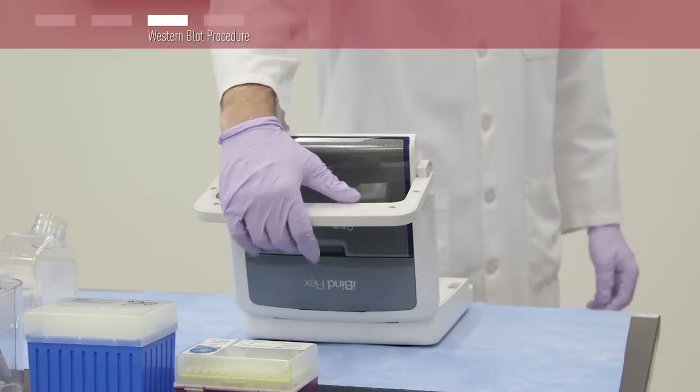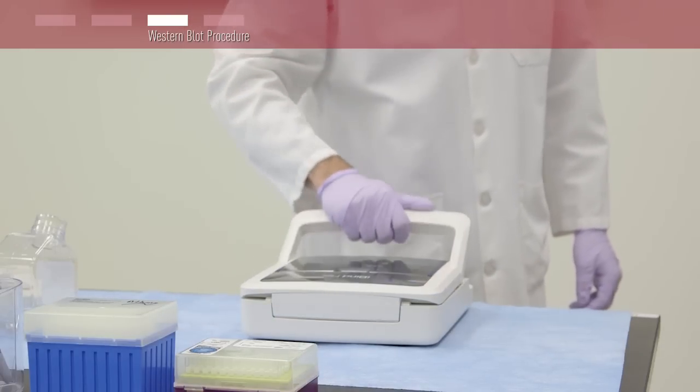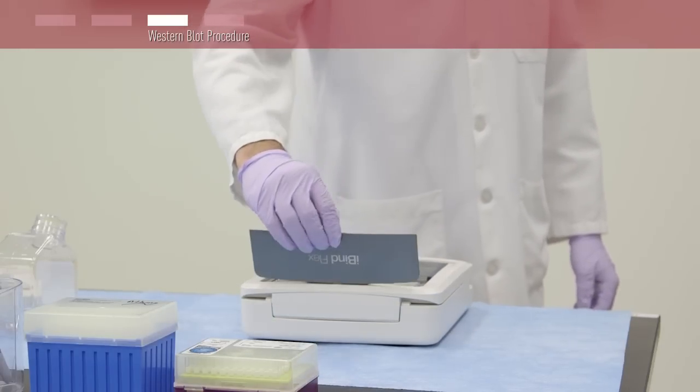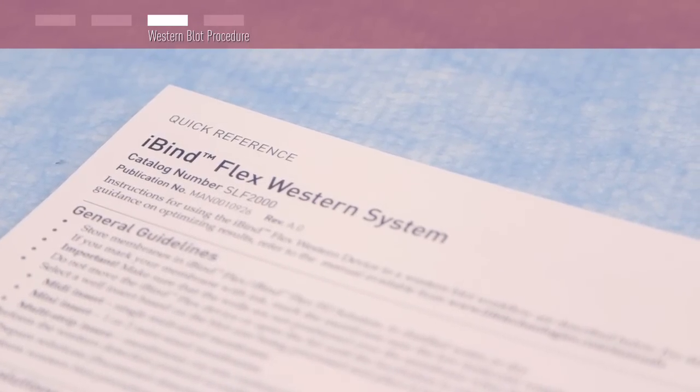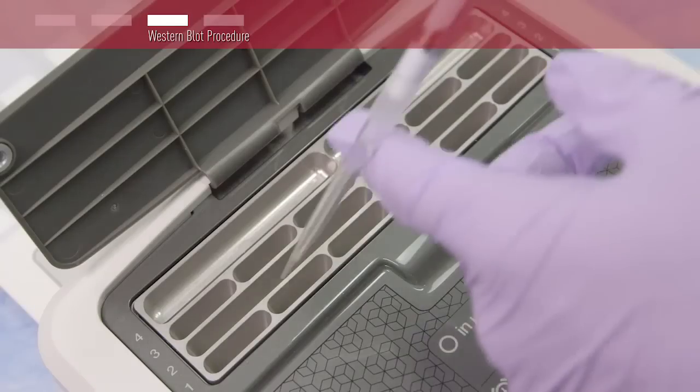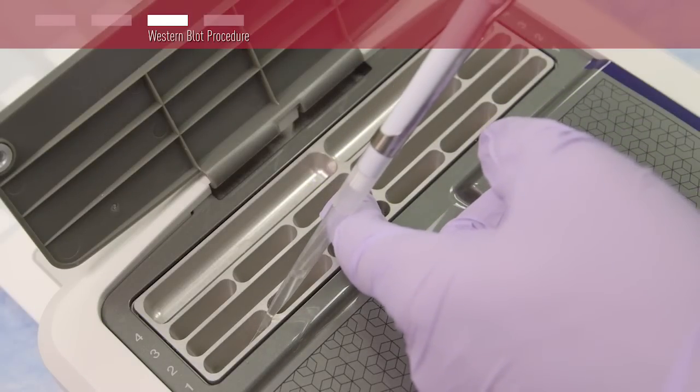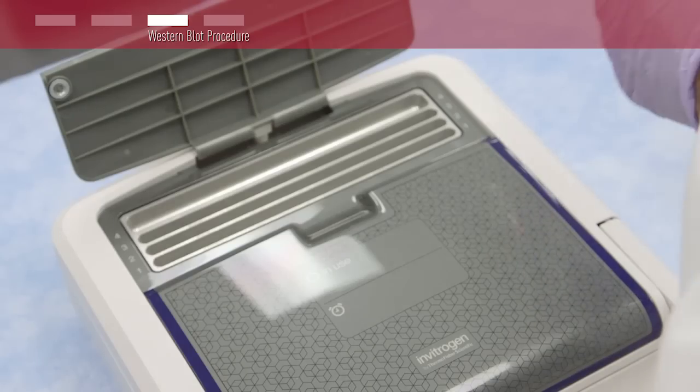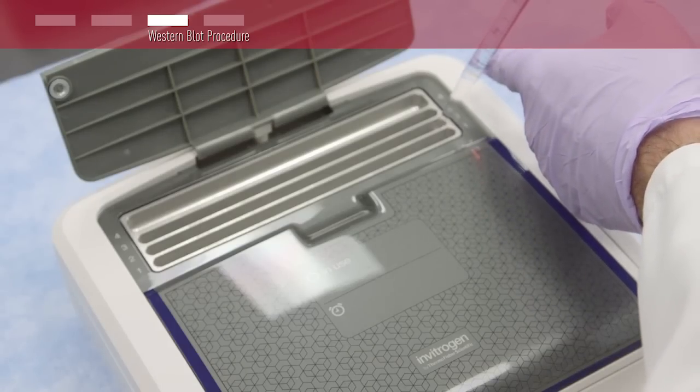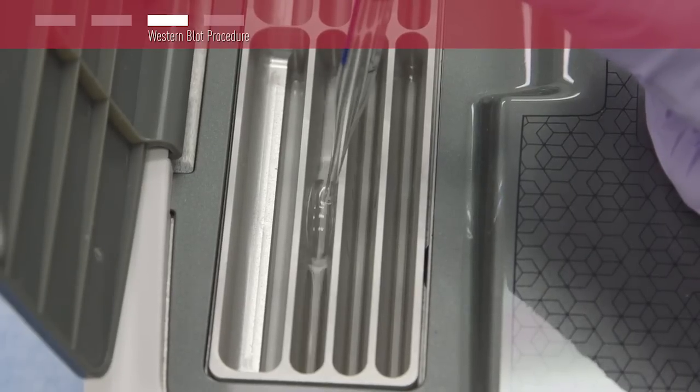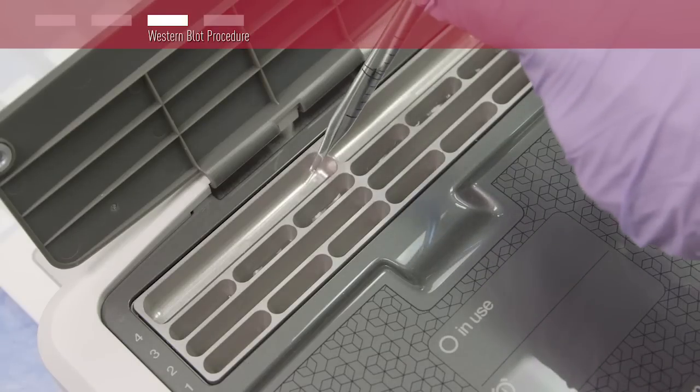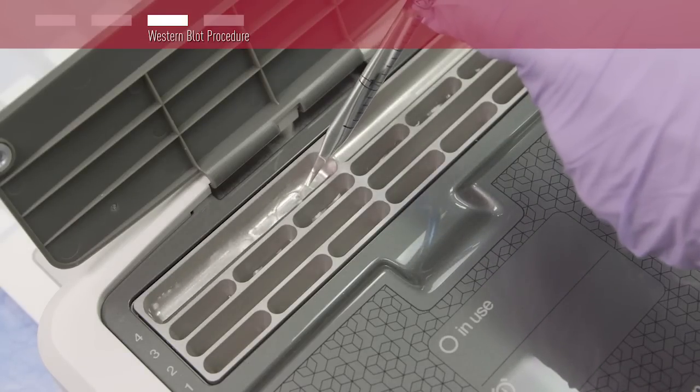To continue, close and latch the lid and open the liquid door to expose the wells. Add the volume of reagents specified in the quick reference card sequentially, starting with your primary antibody in each well of row 1, 1X iBind Flex solution in each well of row 2, your secondary antibody in each well of row 3, and more 1X iBind Flex solution in each well of row 4.